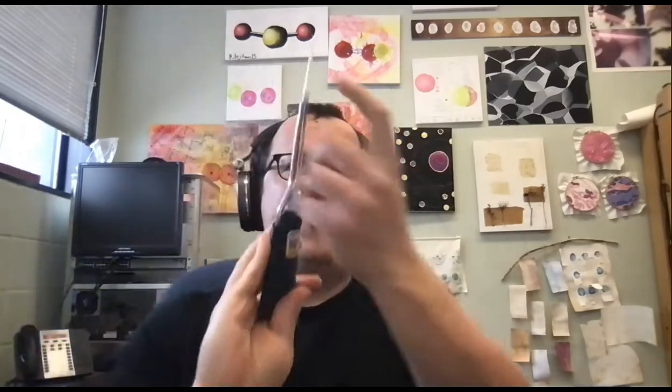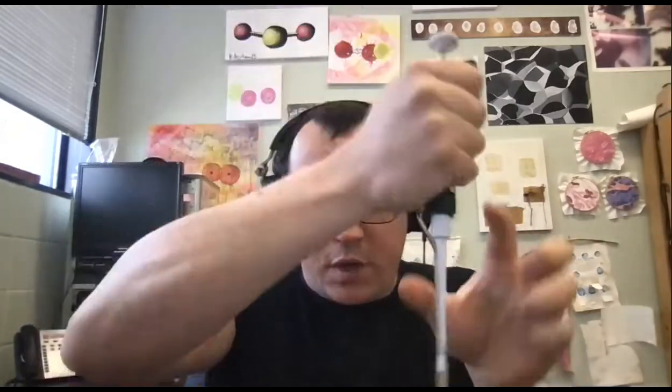If you bring something up into your tip and then wander around, that liquid can go down in there and that messes up the pipette. So always do your measurement, put it into your tube, and then eject your tip into the waste containers. Never flip them over.